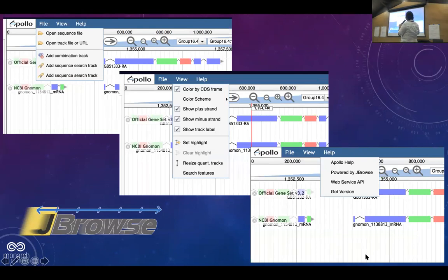And then earlier you were asking me what the different colors meant. In this case, what we have done is that we have colored the different exons by the coding sequence frame. So we were reading a gene model, again in this case where the 5' end is on the left, and the 3' is on this side, and we're reading in the direction of transcription from left to right, and this just means that the coding sequence frame for each of these 3 exons is different, and these two have the same as the one before.